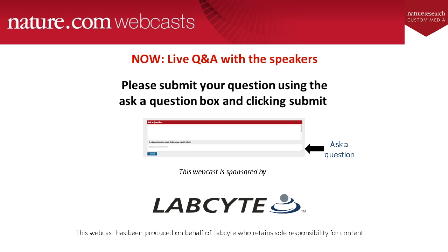Secondly, there is also another benefit that we always experience: the natural diversity of strains is great. So we often encounter novel strains or species in a query data set. By organizing the database phylogenetically, it helps us to identify the organism. Even if it is a novel strain that is not represented in the database, we will be able to place it at its phylogenetic near neighbor level.